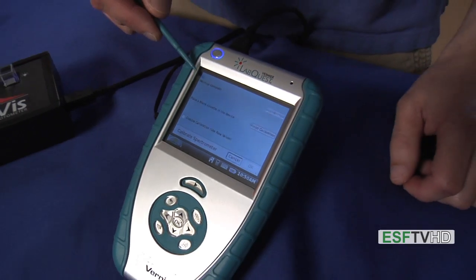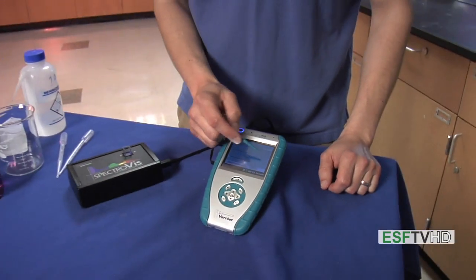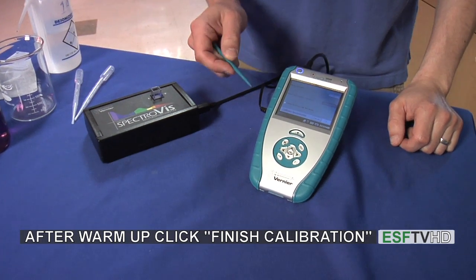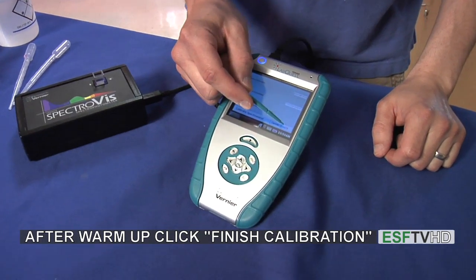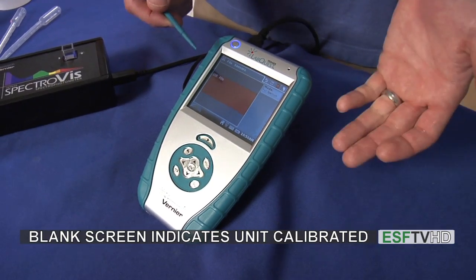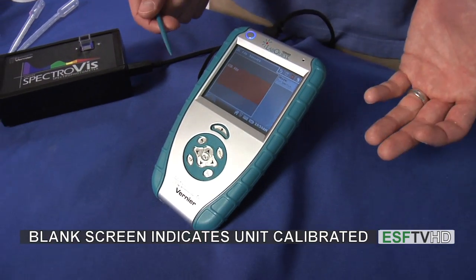The 60 seconds has passed and our warm-up is complete, so we're going to click finish calibration. When we finish the calibration, it'll take a few seconds, and then the OK button will be illuminated. I'll click OK, and we now have a blank spectrum. It doesn't look like anything, because we just have a blank.